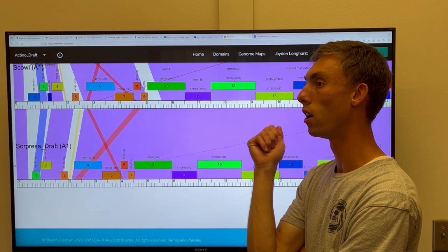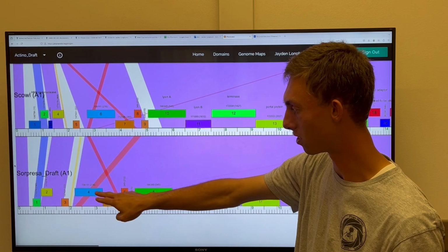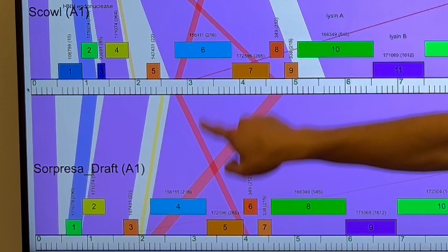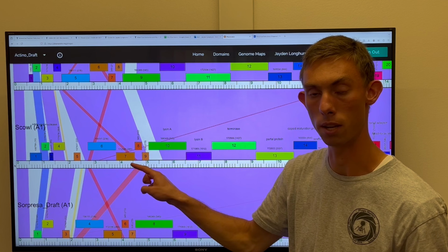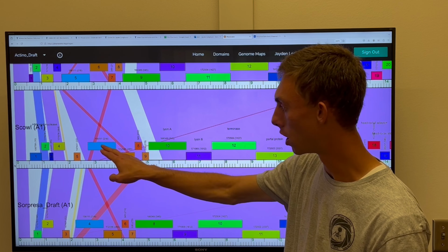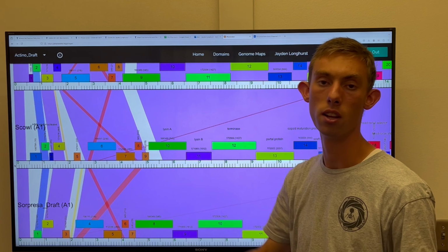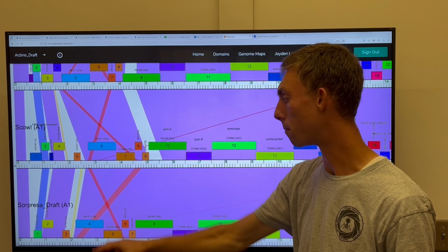You can see graphically that these look kind of the same, and also the numbers here are the same, which can be helpful at times. So you can be reasonably confident that these are referring to the same gene, even though this one has some other genes before, but these are your matches that you're going to be looking at.